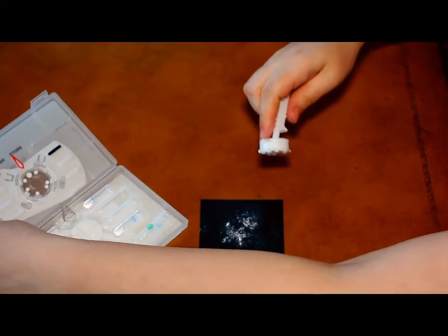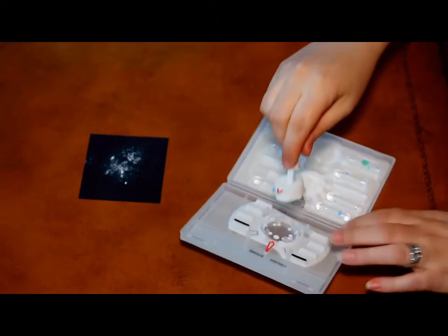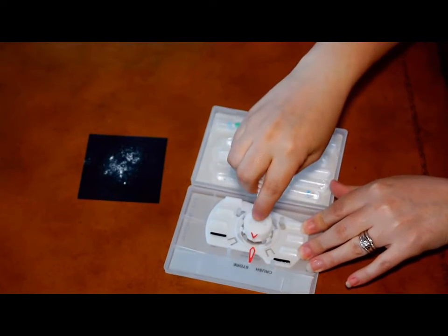Now, make sure to snap the collector into the lid and align the red pointers on the collector and the crusher so that they match.